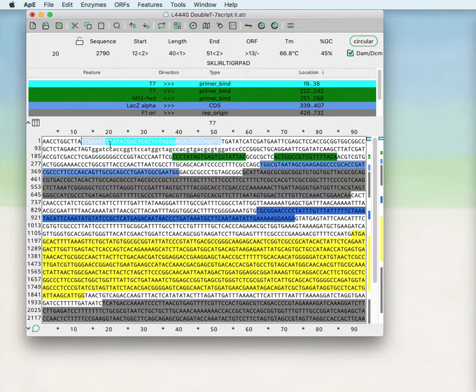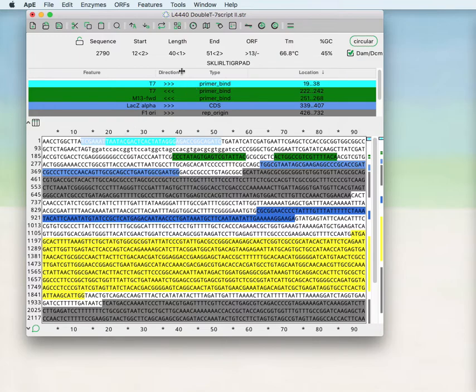The last video we talked about the information about the currently selected region. There's one extra piece of information that was not talked about which is the translation.